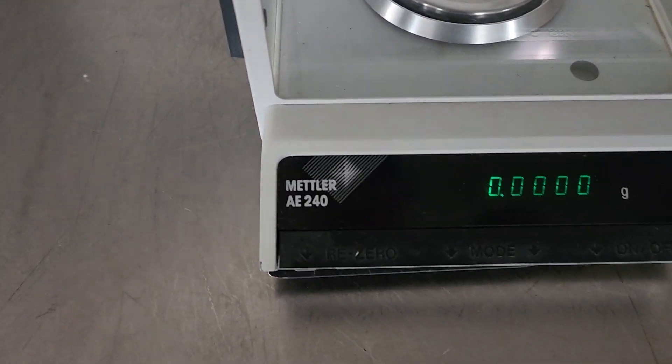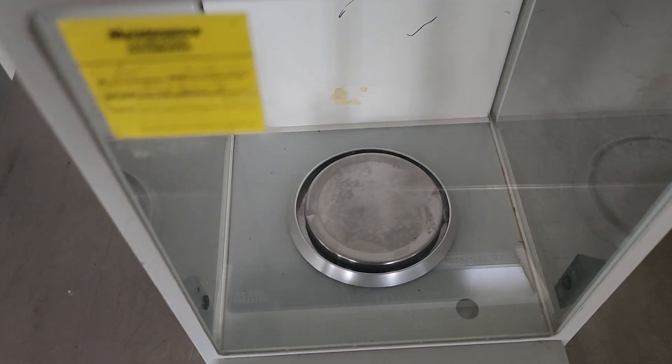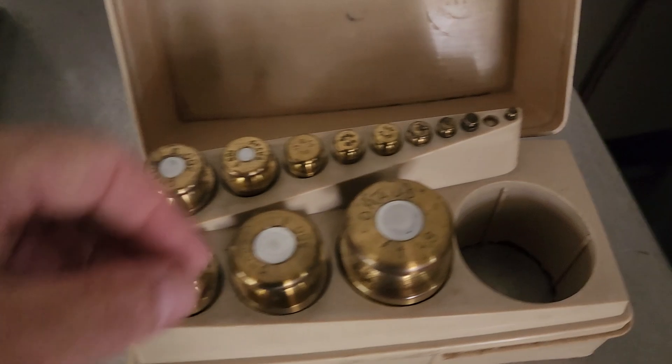This is a Mettler AE240S. Right now I've got it zeroed. I've got my weight set here.